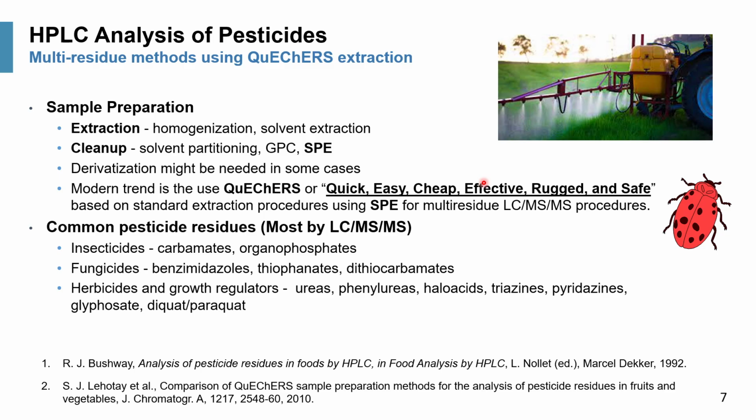So I want to talk a bit about HPLC analysis of pesticides, a multi-residue method for mostly agrochemicals, foodstuff, and soil samples. Now, obviously, the sample prep is quite elaborate for these very complex samples, such as vegetable extracts and soil samples. So there's quite a bit of emphasis on something that is simple, reproducible, and also cheap and quick, right?